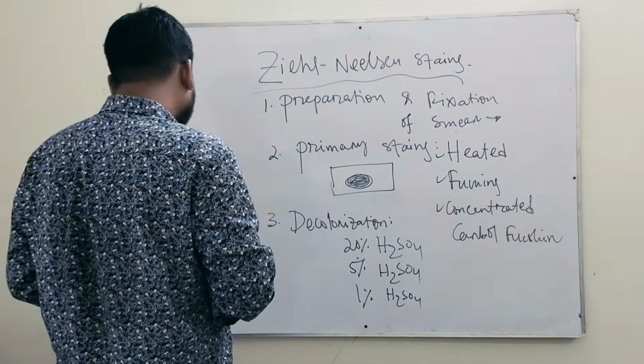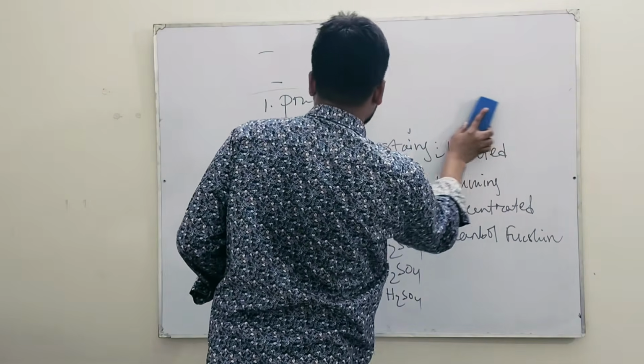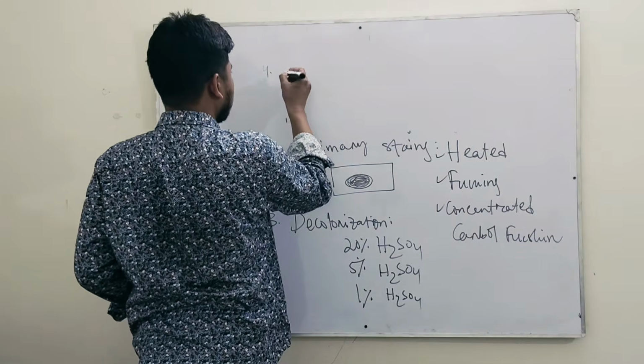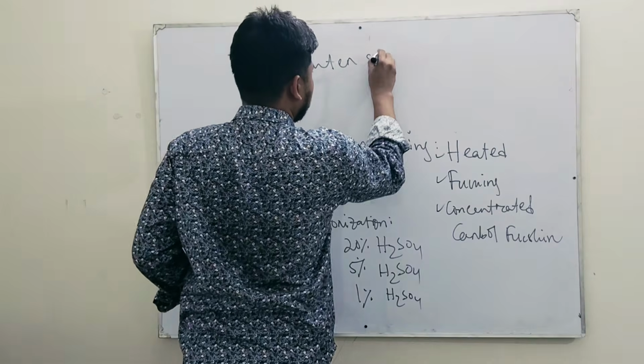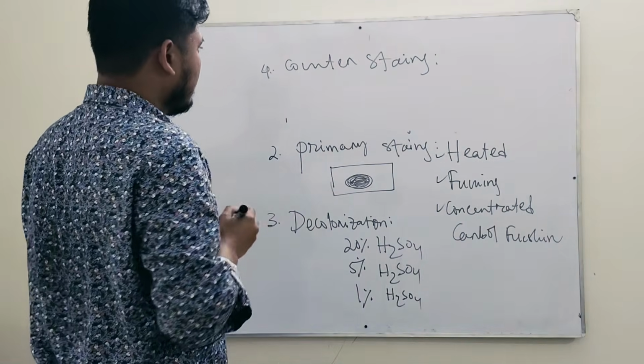After decolorization, the next step is counter staining.